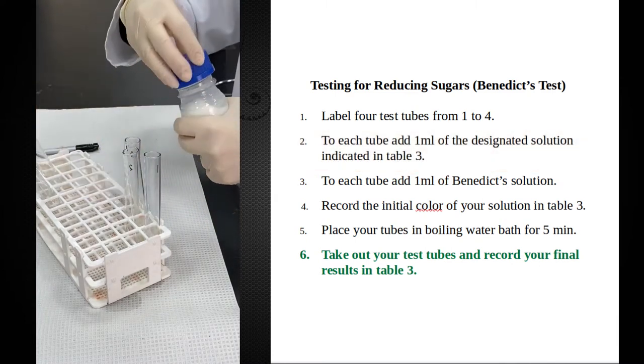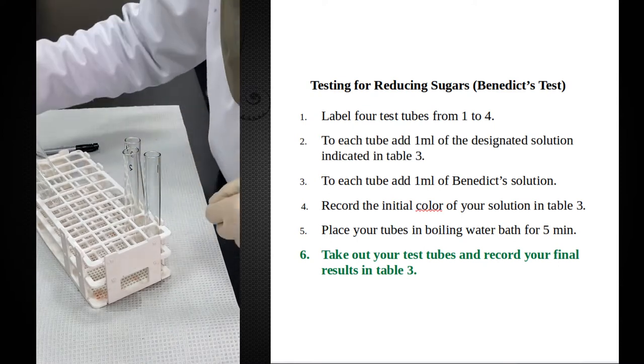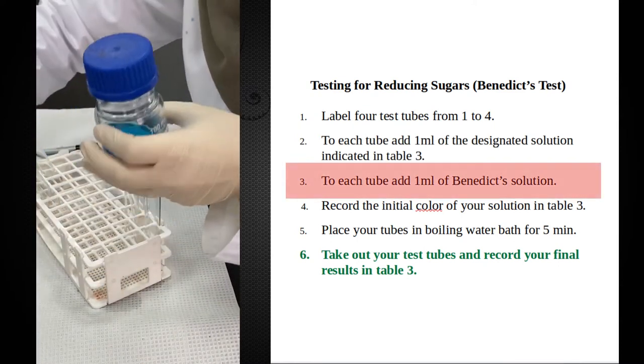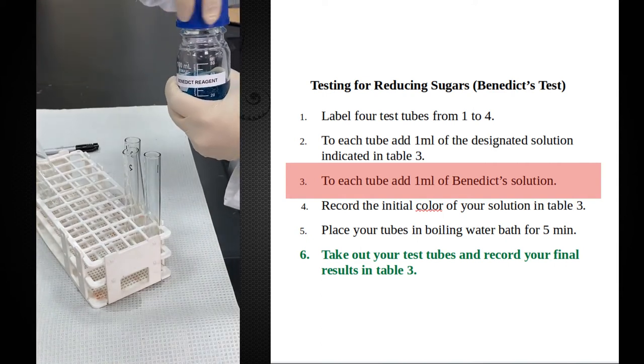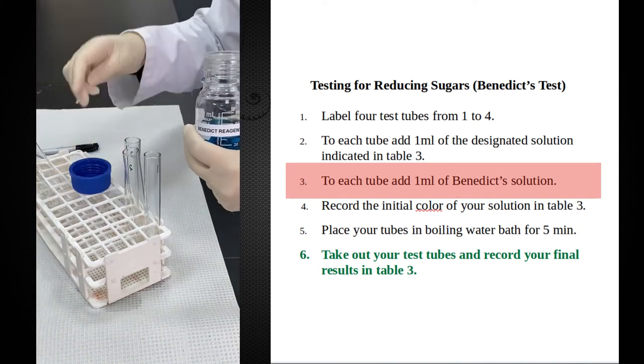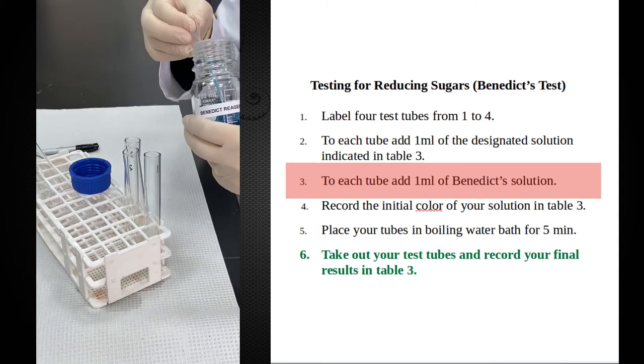With a clean dropper pipette, I will add one ml of Benedict's reagent, which is made of a copper sulfate solution. One ml in each test tube.